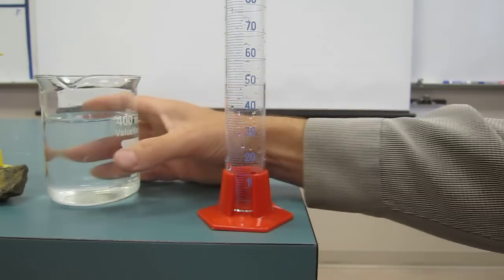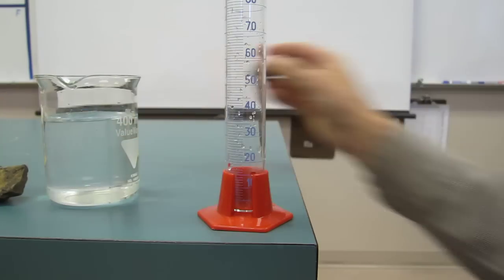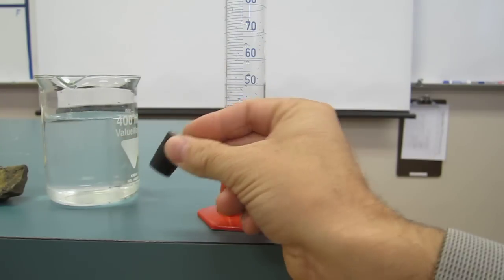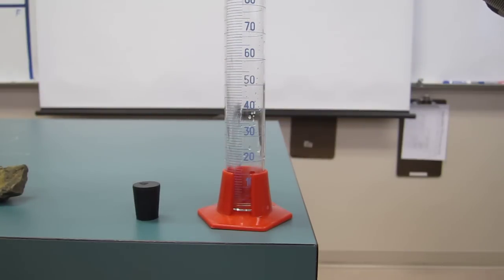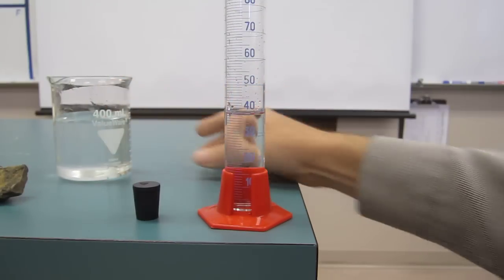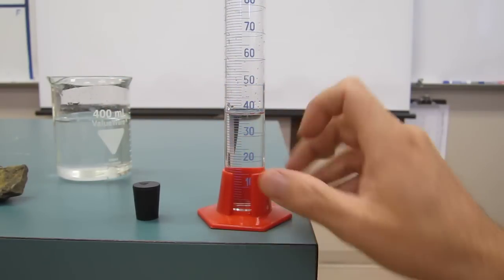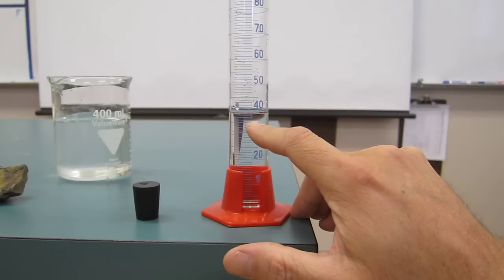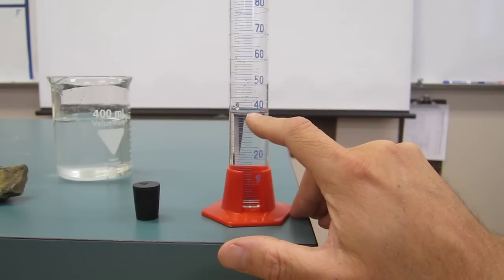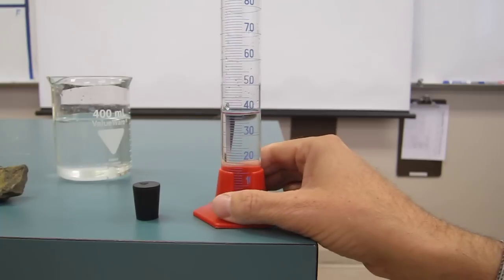So we're going to figure out the volume of a rubber stopper, which is an irregular shaped object. I'm going to pour some water in a graduated cylinder, and I got 30, 35, 38, 39 milliliters of water.